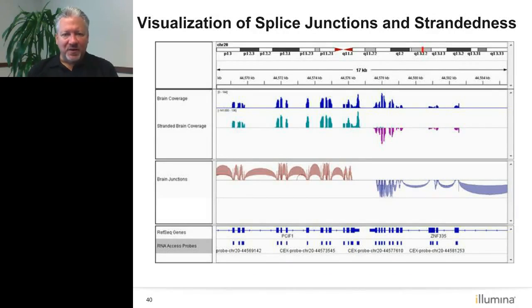The other thing I wanted to remind you of is that this data, even though we target, you can see where the probes are down here, we're targeting exonic regions, frankly the same regions that we target in the genomic DNA. Because we're not probing genomic DNA, we're probing a transcript, a cDNA molecule. We pull out all of the junctions, even though there is not any explicit probe to a junction in the RNA. We capture the junctions quite efficiently because we effectively capture this exon and that exon, so we pull down fragments that also contain the junctions.